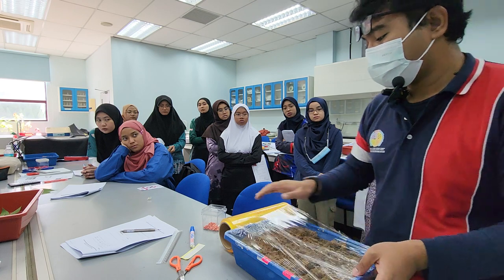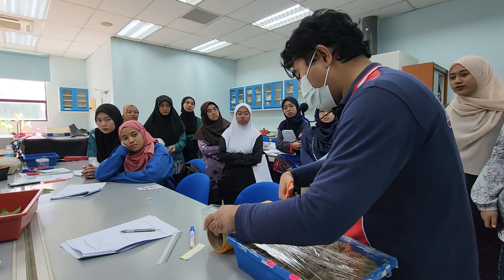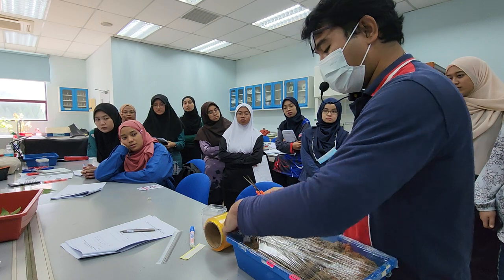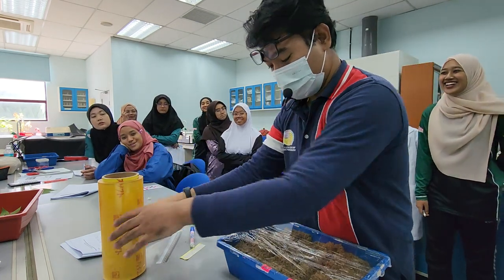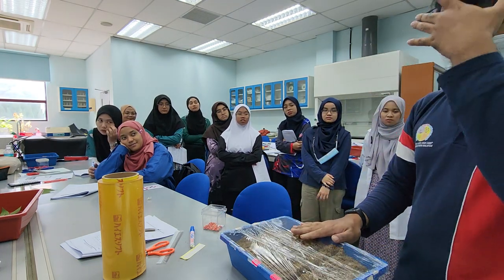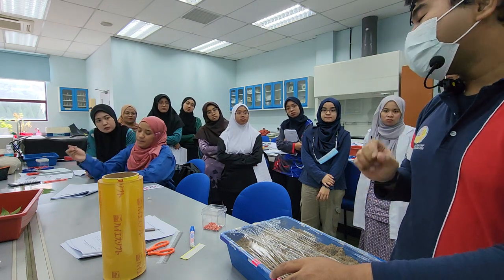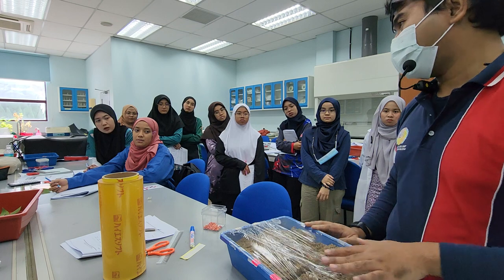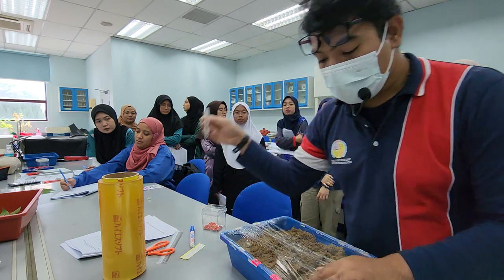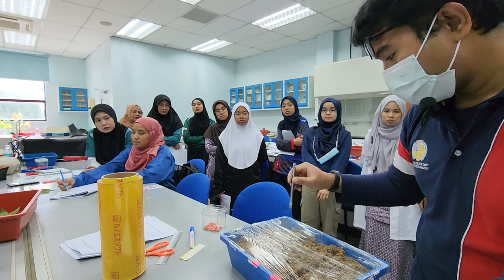Why do we do this? To create humidity, but you just water the plant, the soil. We want to create a high humidity because you're going to place this outside, so the surface of the soil is not going to get desiccated easily, because that's going to kill the seedling. Okay? And then poke some holes. Just some. Enough.